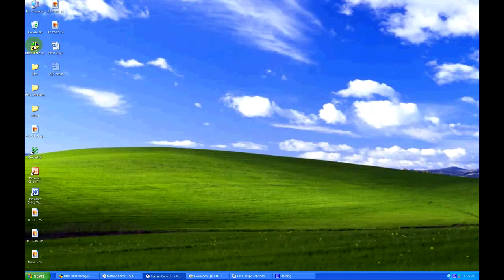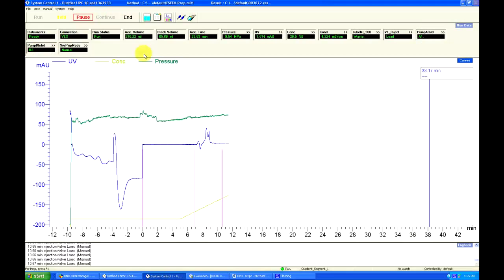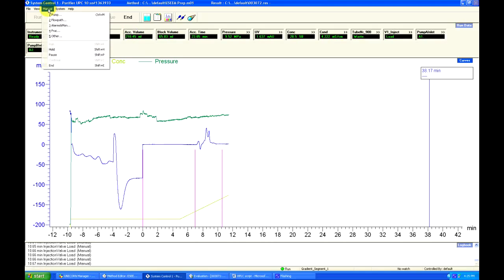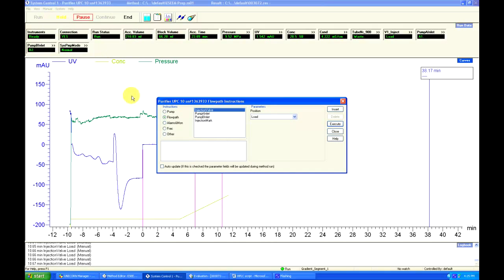With everything in order, we can now inject our sample. We must first open the Unicorn program and open up the system control window. There, go to the top and select Manual, then go down to Flow Path. By default, the parameter selected is Injection Valve. Modify the position parameter from Load to Inject, then hit Execute.